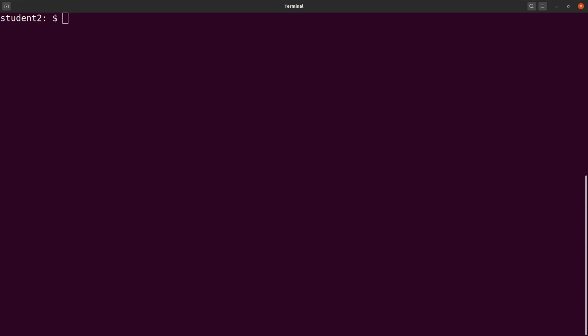So back to our work. I'm on my terminal now. What I want to do is to create a directory that I will perform my actions in. It's advisable to do that. It helps you to organize your files, your activities, and other data that you'll be generating, and also helps you to separate them from other things you've already done on your PC.